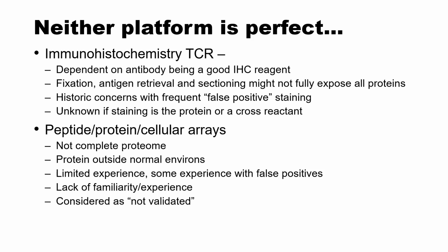The IHC methods may not actually fully expose all proteins, so the coverage of the full human membrane proteome might not actually be true in the case of tissue cross-reactivity. There have been some cases of false positive staining, and if you do get staining, it's unclear if that's actually your target protein in an unexpected location or if it's a true cross-reactant.